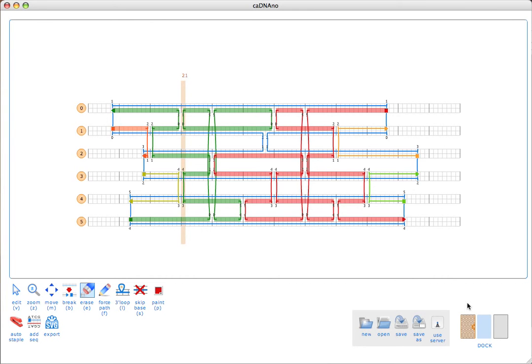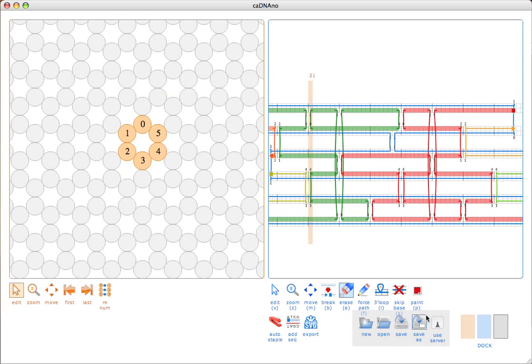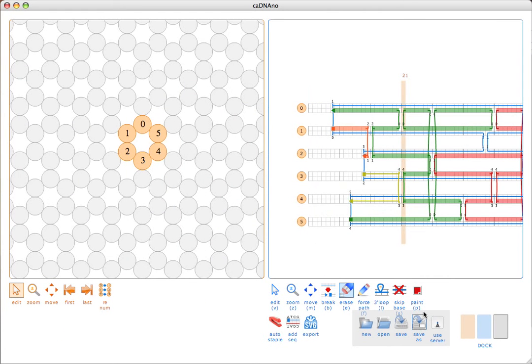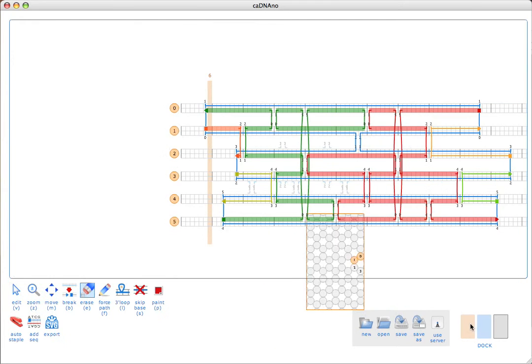Before I start editing those, I'll show you the other way to add a staple to the path panel, which is actually by shift-clicking over in the slice panel. If I just shift-click here, I can add staple strands just one at a time. But I'll just get rid of those since we don't need them.